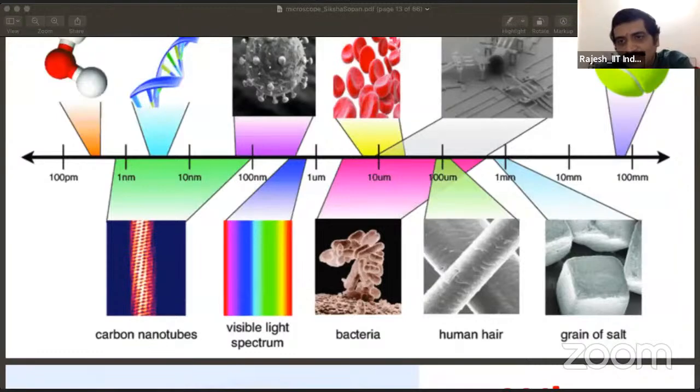Okay. The last question is: when this circuit is completed, the flow of current would also produce a magnetic field. Wouldn't this interfere with the motion? No, a lot of things are taken care of to reduce that.